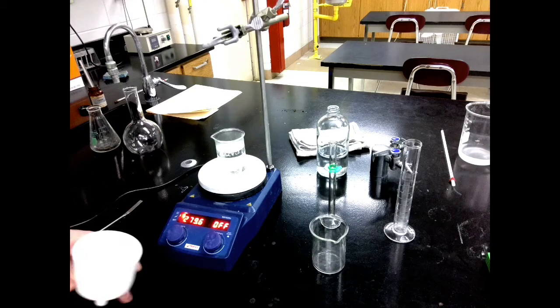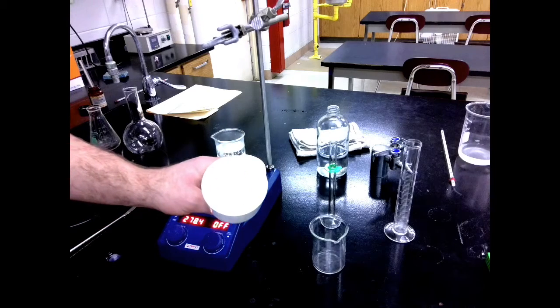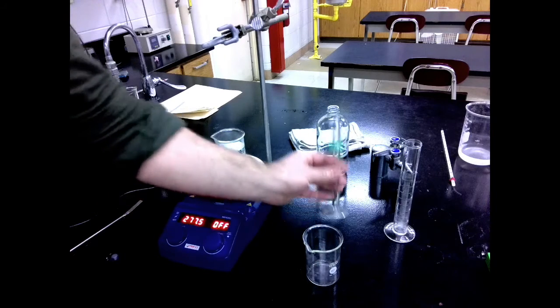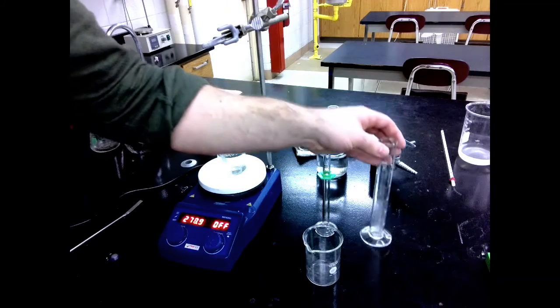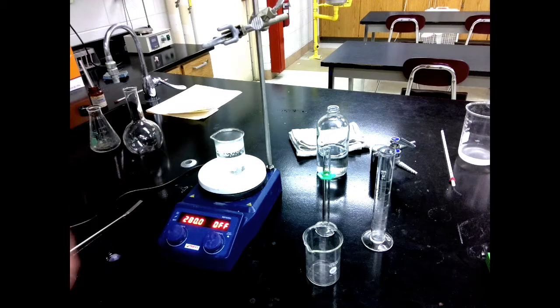For this step, there are a few things that I'm going to need. First off, I need my crude aspirin in my Buchner funnel. I need one of my 150 milliliter beakers. I need my other 10 milliliter graduated cylinder. And I need my 50 milliliter graduated cylinder for my distilled water. I also have my distilled water coming to a boil here, so that should be hot enough.